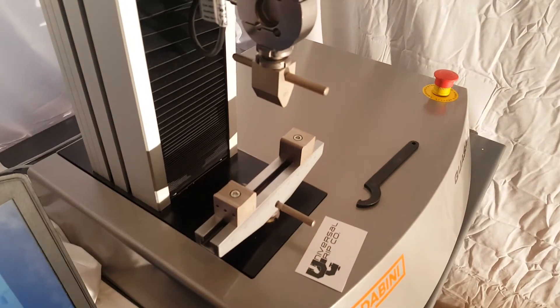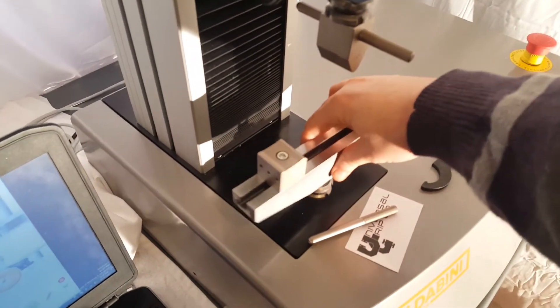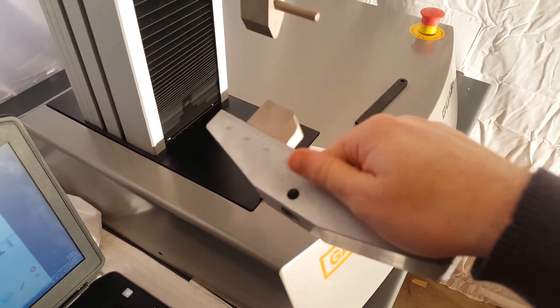I have the bend fixture hooked up now. It's attached via this clevis pin style attachment, which is the industry standard — you'll see this on pretty much any testing machine out there.